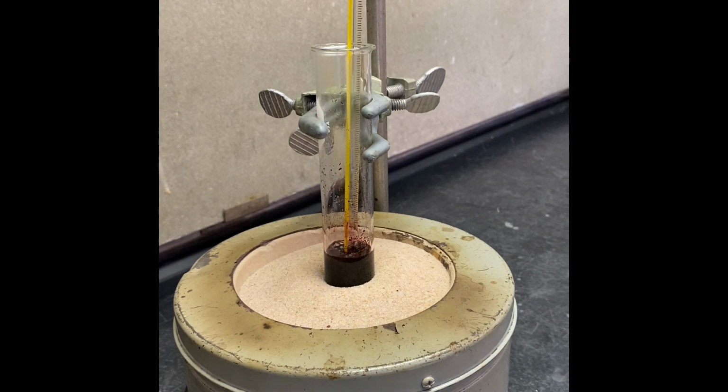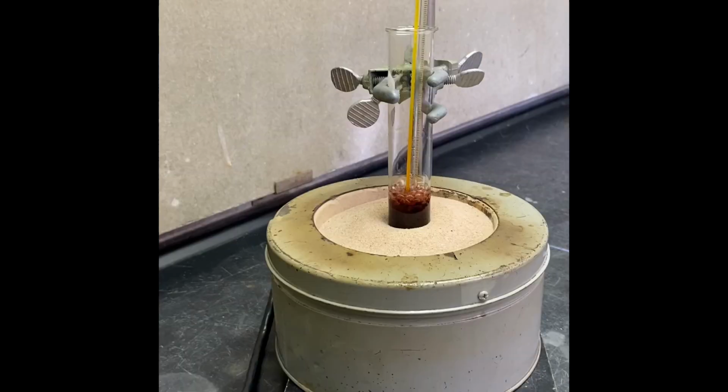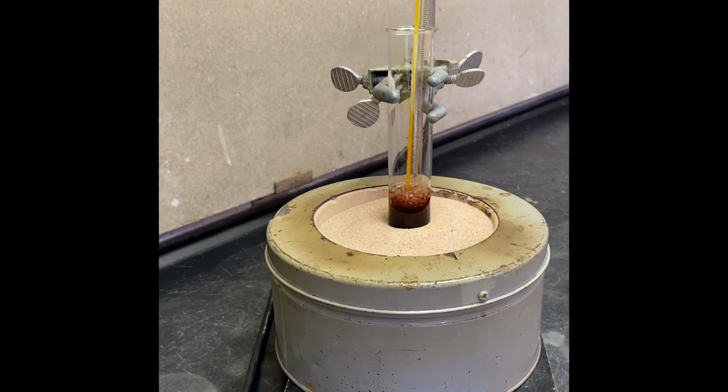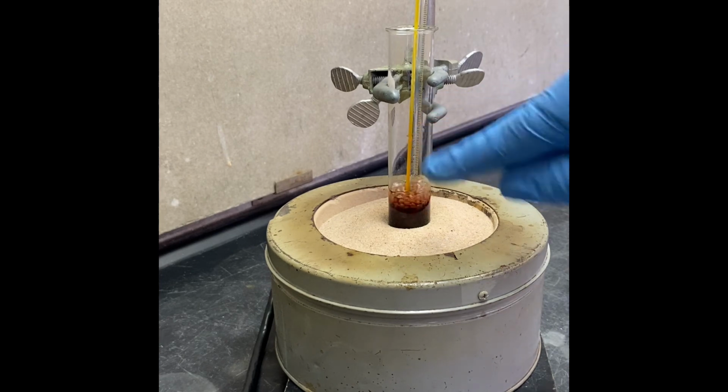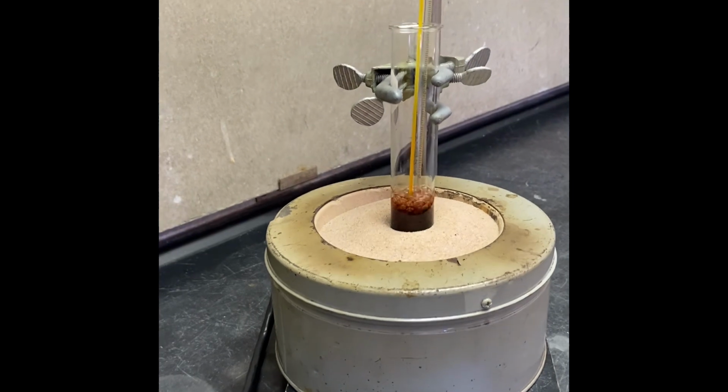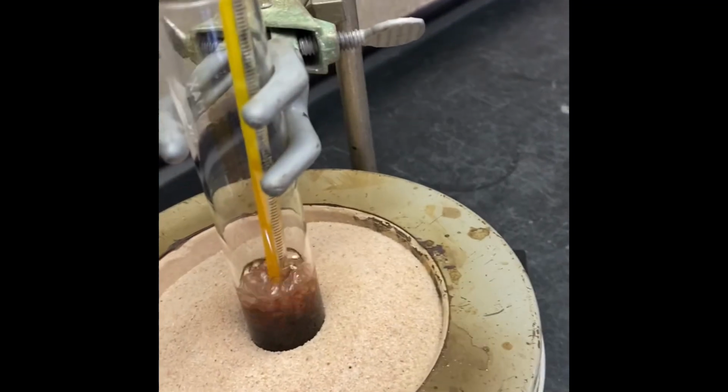We're gonna do kind of reflux in that temperature, so that way the solvent can wash out our glass walls. Our temperature now around 183 and it's boiling as you see, and it's kind of refluxing, washing the walls, so getting condensed, and also the color getting lighter than initial. It was dark.